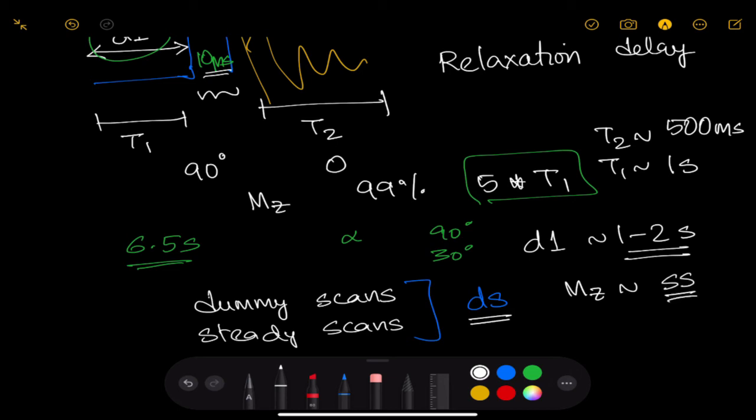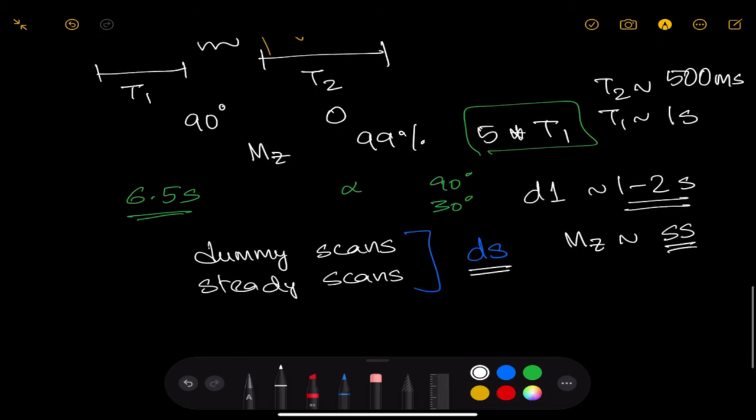This is important because most often NMR spectroscopists would like to get proton 1D NMR spectra which are integratable, because one ends up relating it to the concentration of the spins that are present. So the purpose of these dummy scans is to ensure that a certain steady state is reached for all the spins, so that following acquisition of the NMR spectrum, one can integrate and get meaningful results.